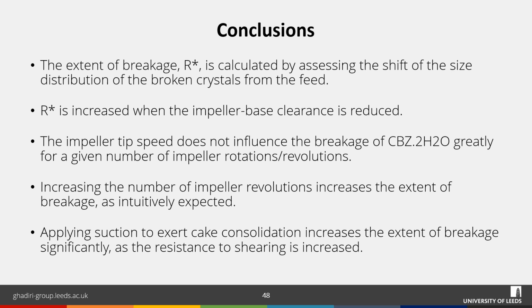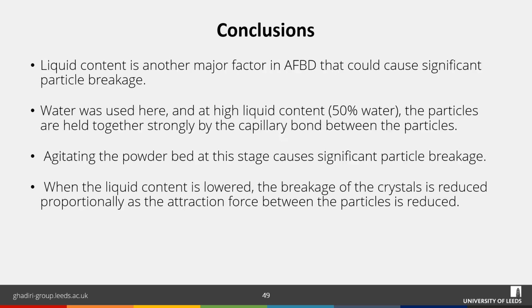The impeller tip speed does not influence the breakage of carbamazepine dihydrate greatly for a given number of impeller rotations. Increasing the number of impeller revolutions increases the extent of breakage, as intuitively expected. Applying suction to exert cake consolidation increases the extent of breakage significantly, as the resistance to shearing is increased in this process. Liquid content is another major factor in agitated filter bed drying that could cause significant particle breakage.